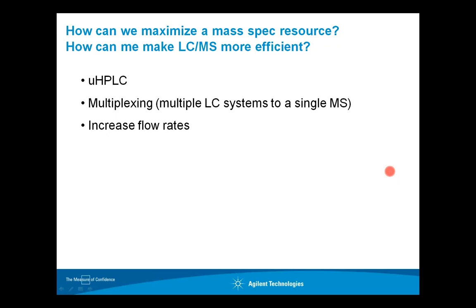So many of the solutions have revolved around making the liquid chromatography step more efficient. So things like UHPLC, where the chromatographic system is micronized, resulting in a faster cycle time. This often also manifests in less solvent use and less waste.